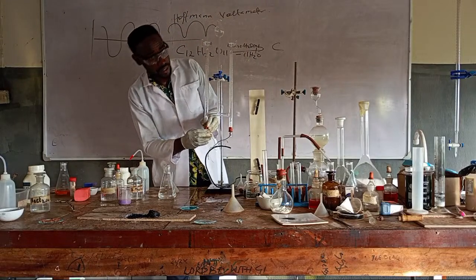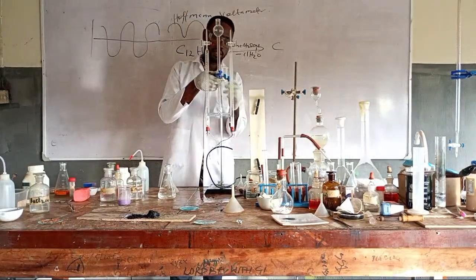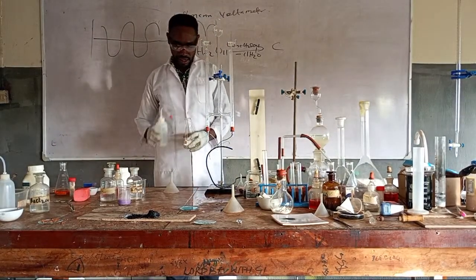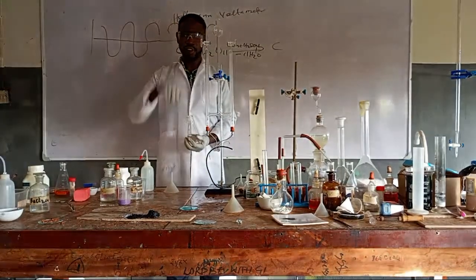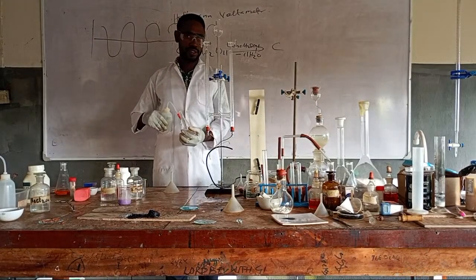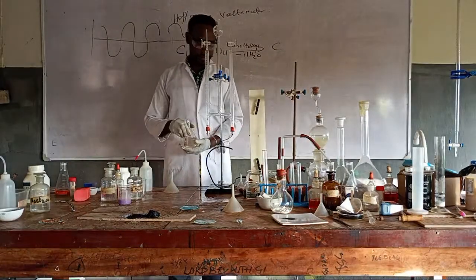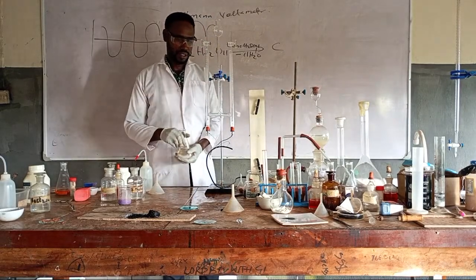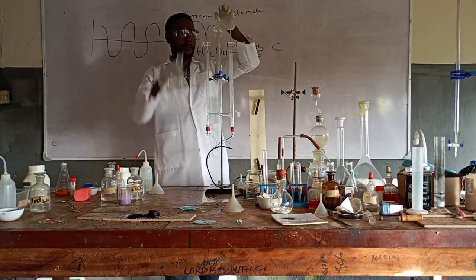But you can't get sugar. I'm not sure whether you can come back to this class. No, if it is too much acidified, the product coming out is not what we want. Do you understand me? No amount of acid will change the product.